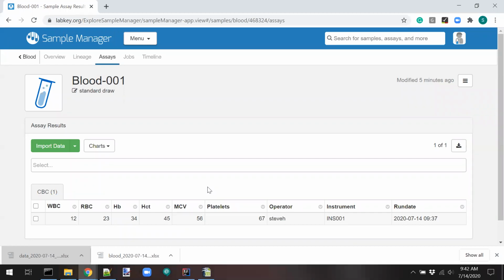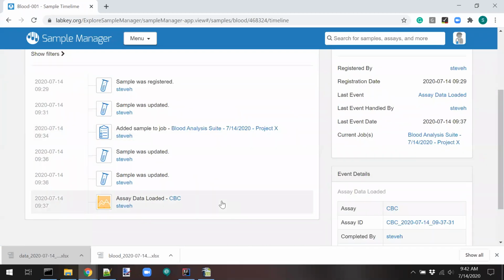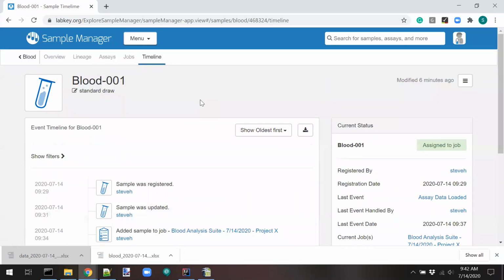Any other thoughts there, Jason? No, I agree. I think you're correct. I think it would. But yeah, that's not part of the demo, but we can have that conversation again separately and offline if you want to see that outside of this webinar.